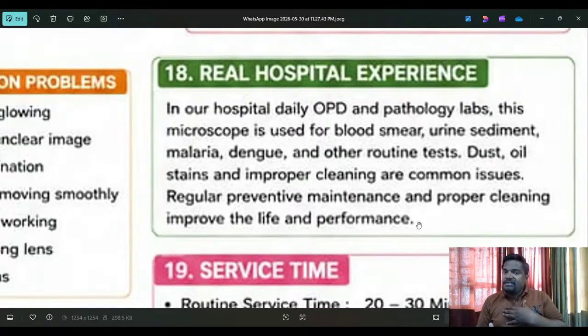Sometimes my advice is to take one paper and write the very valuable points on how to use the microscope, and stick it in front of the machine. Then the technician can understand how to use it. Before using, what to do and what not to do are also mentioned, and precautions too. Then problems will mostly reduce, good rapport will develop, and face value is growing. Understand?